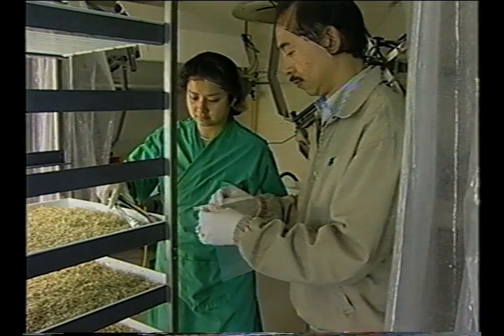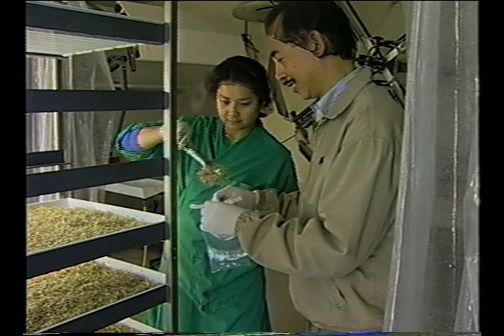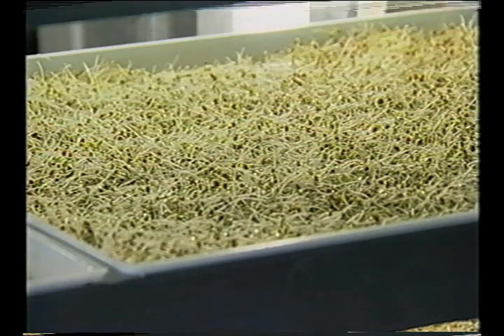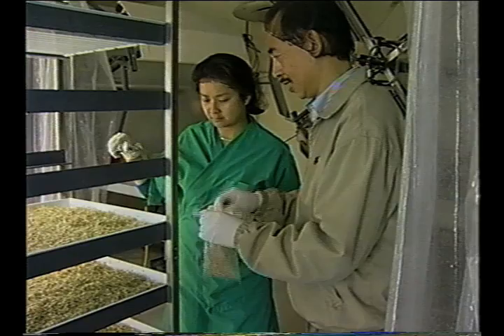If sprouts are sampled, 32 sample units should be aseptically collected, each approximately 50 grams or about 2 ounces. Sample units should be collected throughout the entire production lot, meaning from top to bottom, side to side, and front to back of the tray or drums.